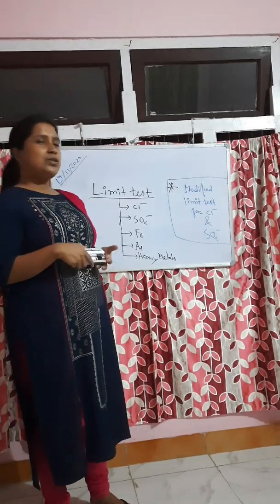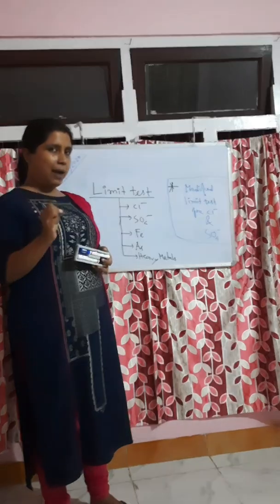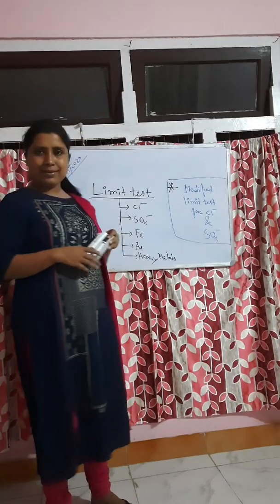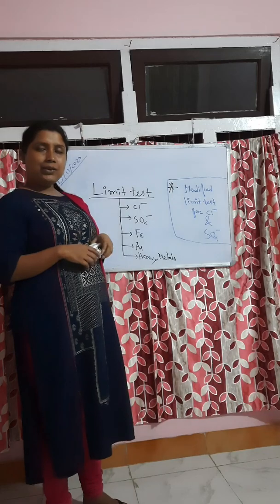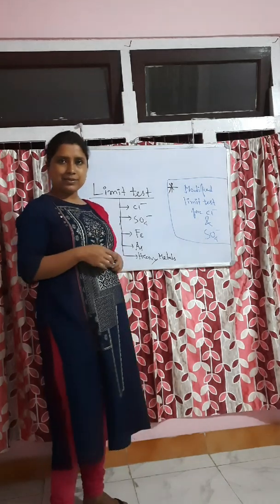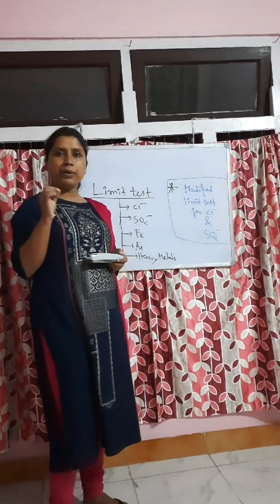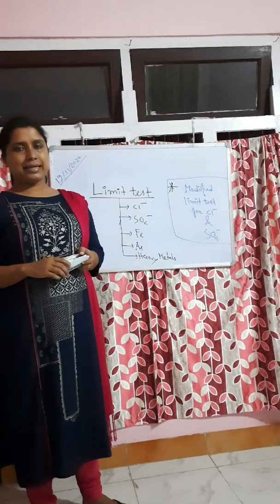So today I'm just coming to revise all these things. What are these things? I'm going to discuss the limit test of chloride, sulfate, iron, arsenic, and heavy metals. I hope all of you have a basic idea about limit test.